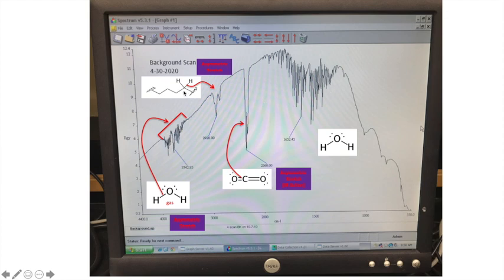I always thought it was carbon-hydrogen and carbon-carbon bond absorptions due to the plastic, but I saw online somebody was saying it's water vapor, so maybe it's both. I'm not sure. But it looks like it's water vapor. So look, it's doing a bend. So there we go. This is water and probably the plastic as well. It's got to be.